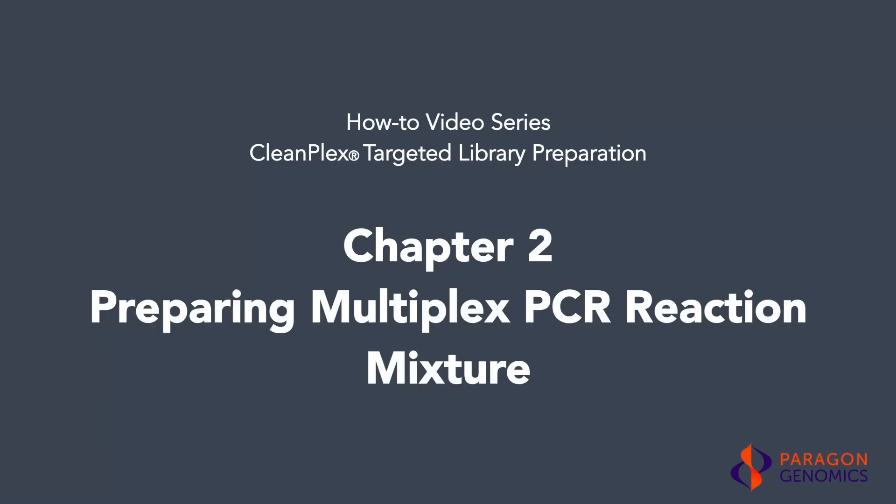The CleanPlex targeted library preparation protocol consists of three steps, each followed by magnetic bead purification. The first step is a multiplex PCR reaction. In this video, we will show you step-by-step how to prepare the reaction mixture for the multiplex PCR reaction.